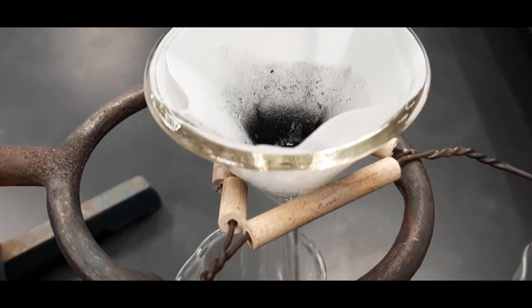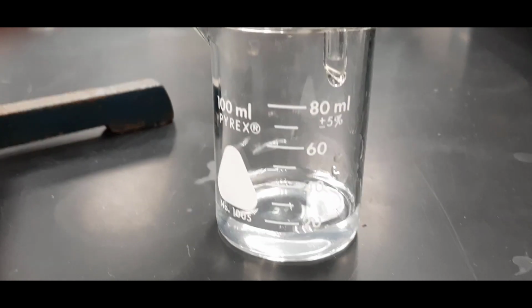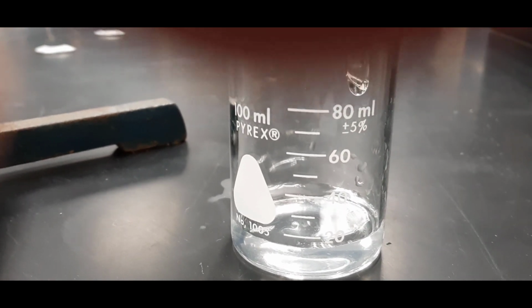At this point, the filtration is mostly complete. Looking at the solution, it's clear that none of the charcoal has passed through the filter paper.